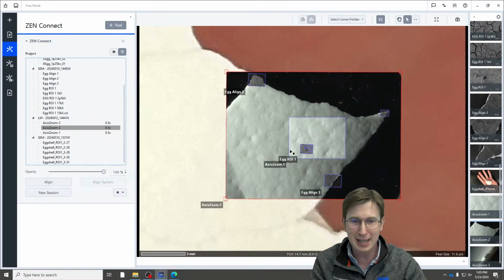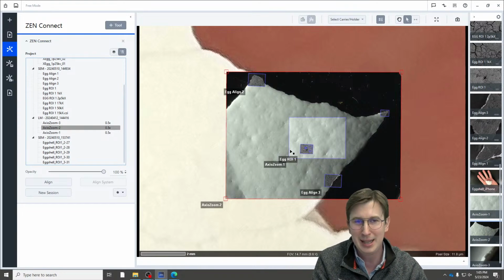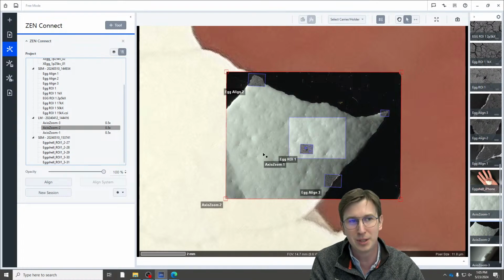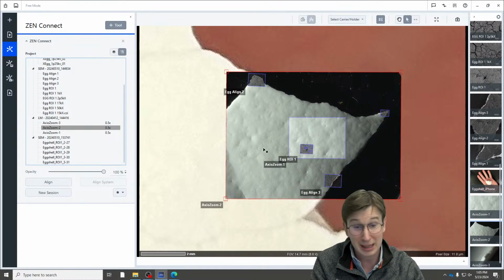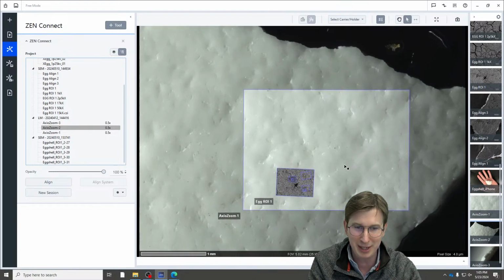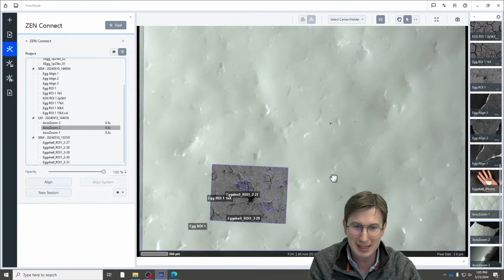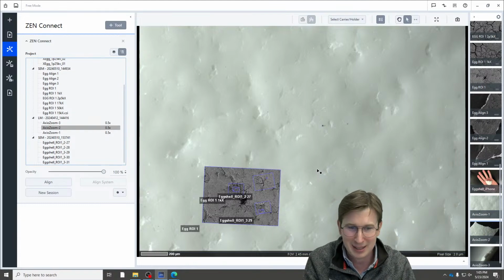So the movie magic here is that I took that piece of eggshell, and that's what I then prepared on a microscope stub, and then brought to our Axio Zoom, an optical zoom microscope where we can use light to inspect the surface, and that's what we see here. And then I took a higher magnification. Imagine you had a really, really good magnifying glass, or in our case, a really good optical microscope.